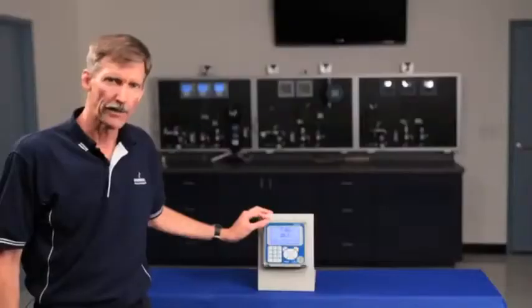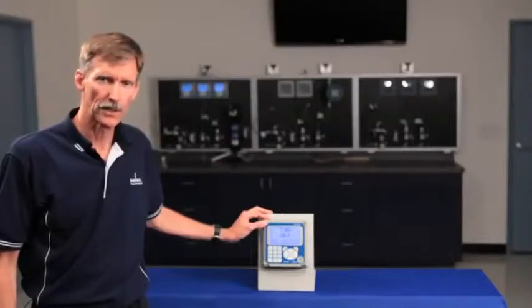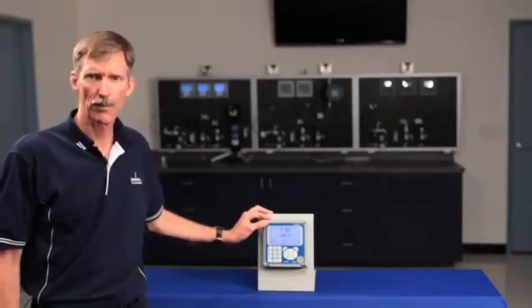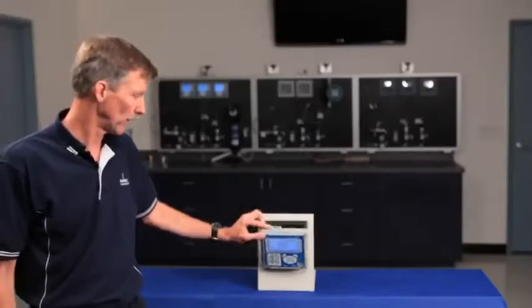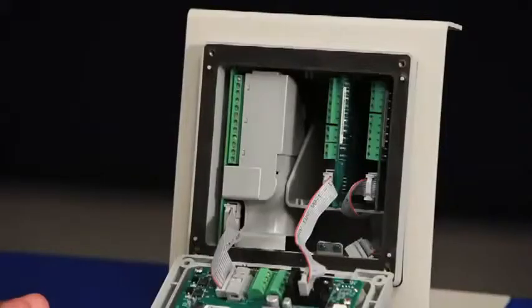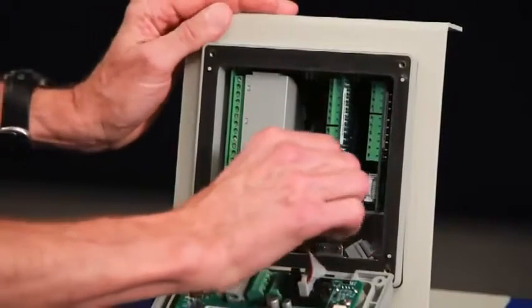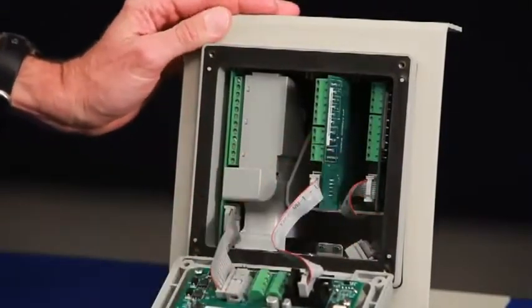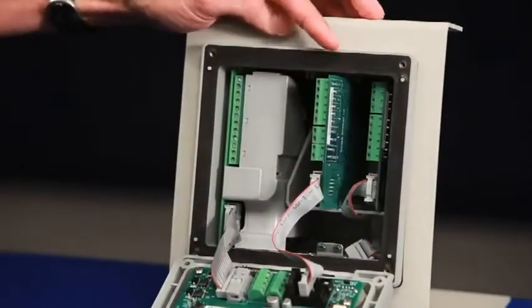For wiring, the Model 56 completely avoids complex internal architecture and hard-to-access wiring points. The modular design of the Model 56 allows technicians to slide out the signal boards and to wire the sensor leads directly to the terminal blocks of the sensor boards.